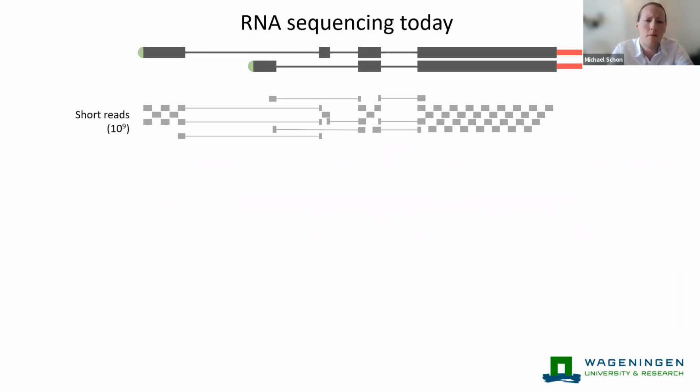And that brings us to the RNA sequencing technology that's available today. There are other ways to validate different aspects of your assembly. So most assemblers were designed for short-read sequencing, and we can see that shown here as little fragments of the total RNA pool. However, more sequencing techniques have come along, including methods that selectively capture and amplify the precise RNA 5' end, the transcript start sites, or the 3' ends, the polyadenylation sites of molecules.